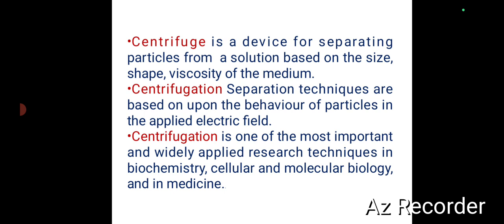Today we will discuss the types of rotors. These types of rotors are mainly used in centrifuge apparatus for the centrifugation process. Now we can learn about the centrifuge and also the centrifugation process.